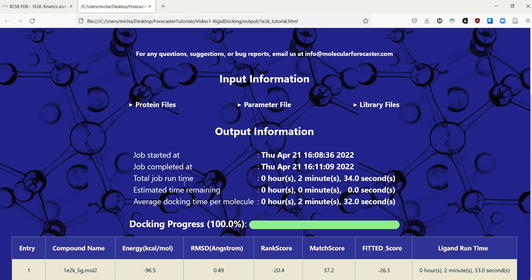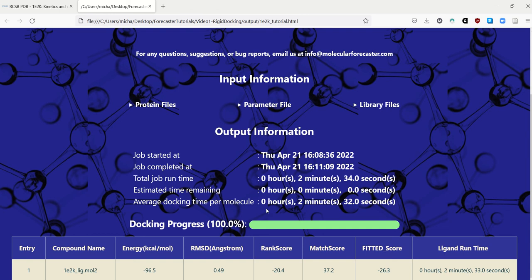And if you look at the HTML. It will give you a summary of the docking run. So it took 2 minutes and 34 seconds for the entire job to run. For the entire docking job to run. And these are the values that are obtained for the best docking score. So the RMSD is 0.49, which is excellent.